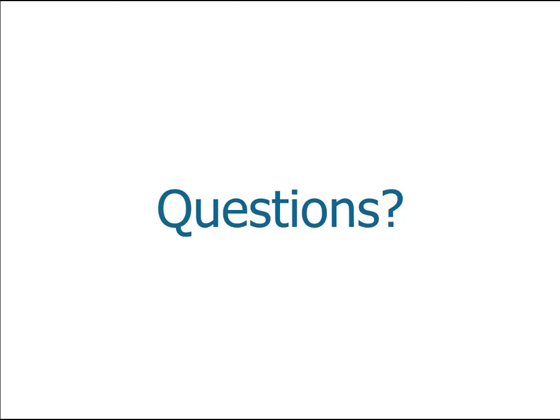Thank you. And a question for Kevin. You mentioned this system has DLS, but also mentioned the system uses SLS for aggregation. How would DLS be useful for this kind of analysis?